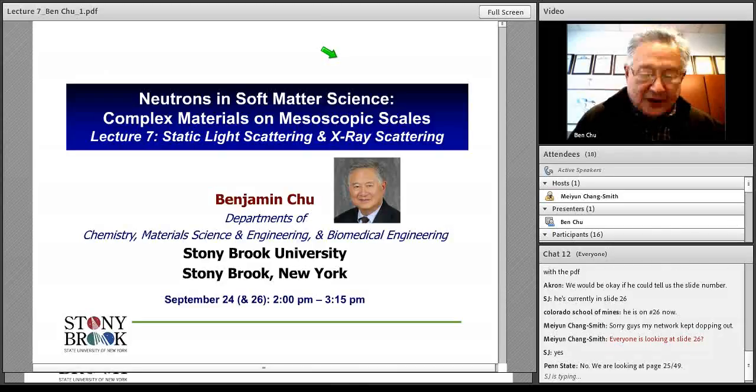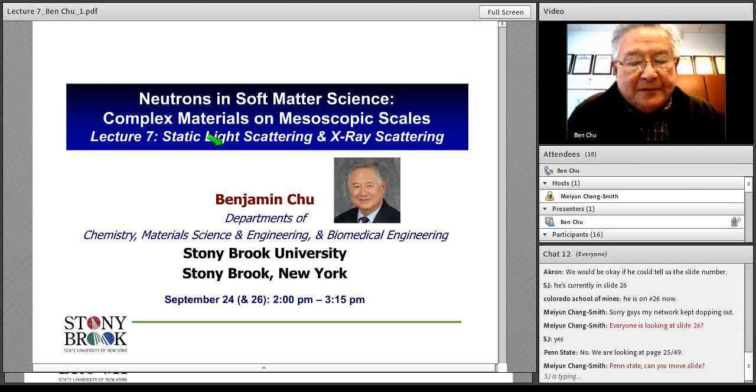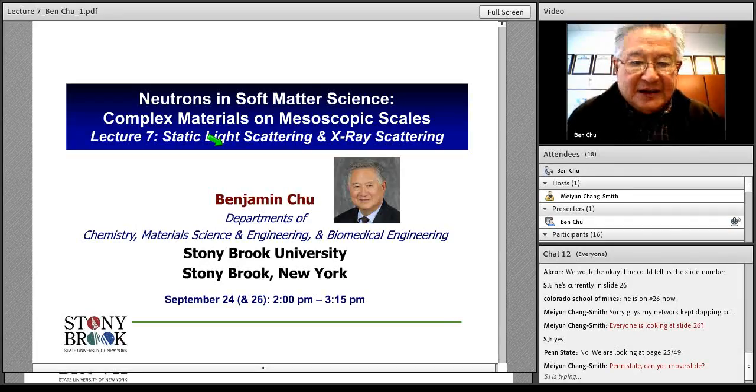So I was talking about the optical constant H in this case. Therefore, there's a lambda to the fourth dependence I said you have to pay attention to. In addition to that, you also see the dn/dc, the partial change of refractive index with respect to concentration. And that means there's a refractive index increment associated with this.